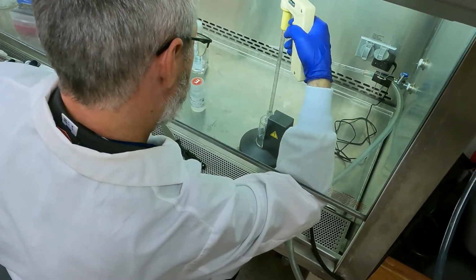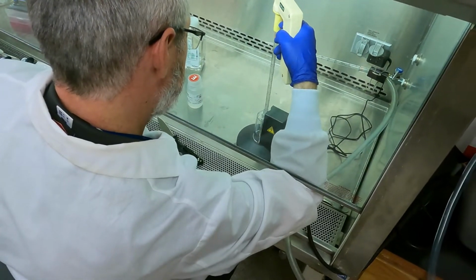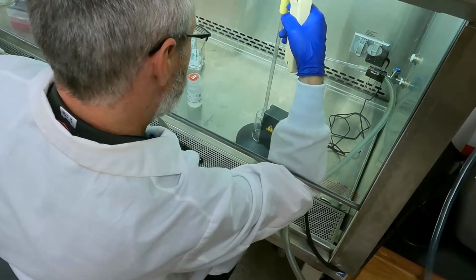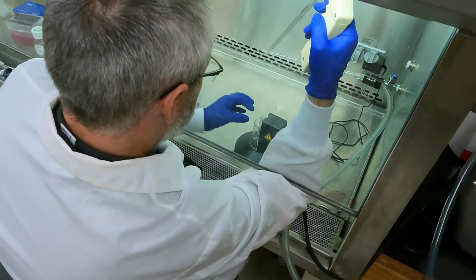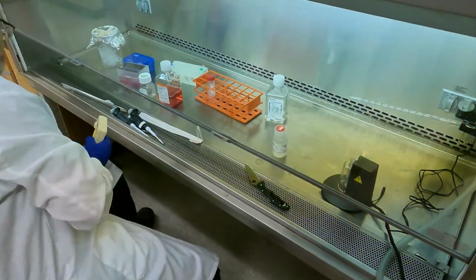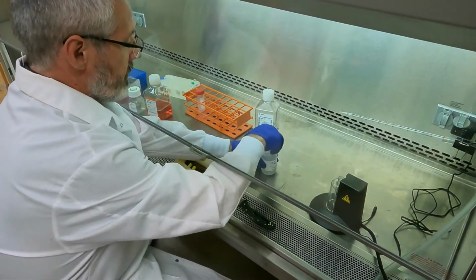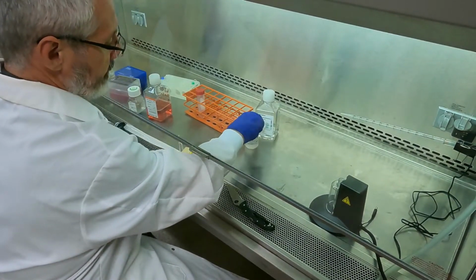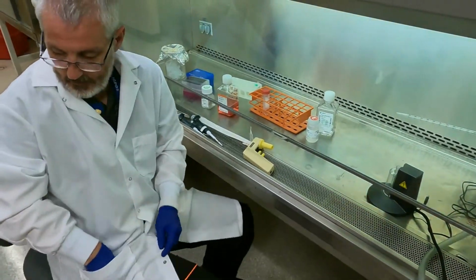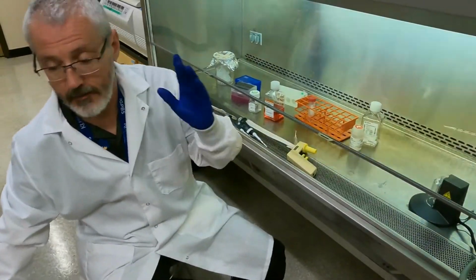Put that right down to the bottom, like that, and push it in. Just make sure it's in. And it's in. Good. So that's the machine ready. I think we're going to put a bit more tape on there.